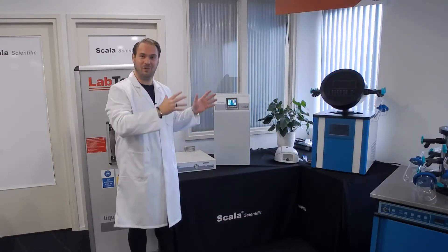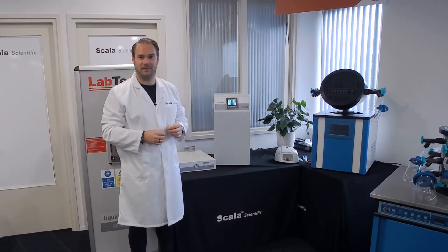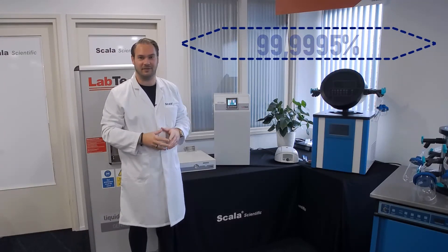Also, very important when talking about the nitrogen generators is the purity of the nitrogen. And with most models, this is around 99.9995%. So it's quite easy.